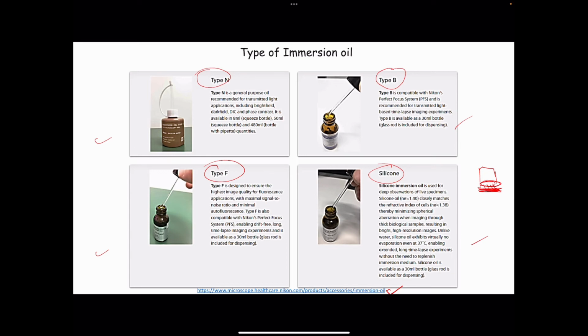Now, when we say that the dispersion value of the oil should match, it means how much the oil allows the rays of light to disperse, which is also one of the properties of light. If any mismatch occurs here, light will get a chance to have refraction episodes, which leads to loss of light rays, either by moving out of the medium, or by hitting the metal mounting of the casing of your objective.